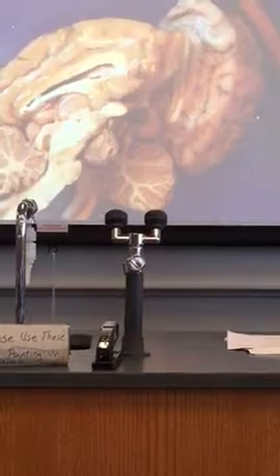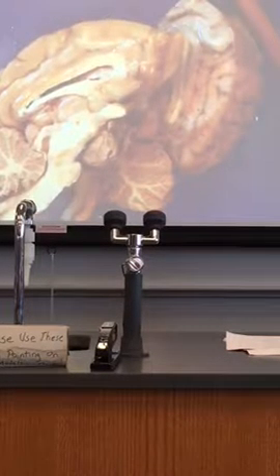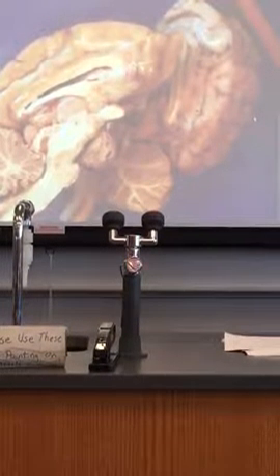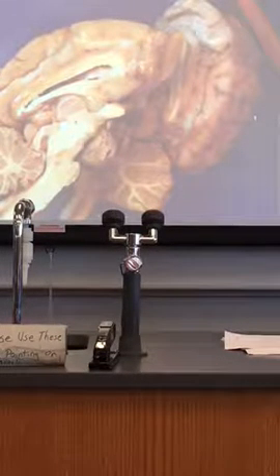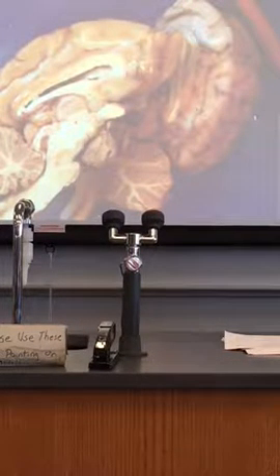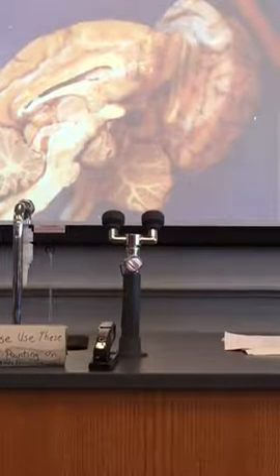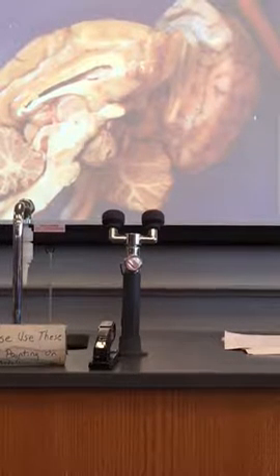Any anatomy on the pig sheet that we haven't seen yet that you'd like to see? We're going to make one more cut. With the ventricles, all we can see is their basic area. The horns of the lateral ventricle, something we do on a model. Well then, the last cut is to take a look at white and gray matter of the cerebrum.